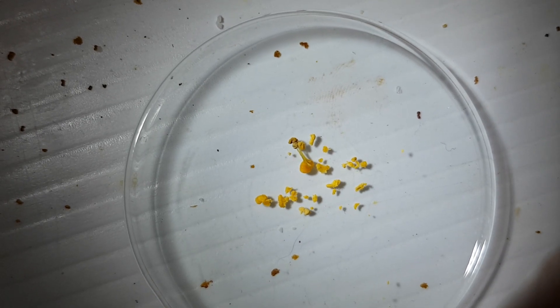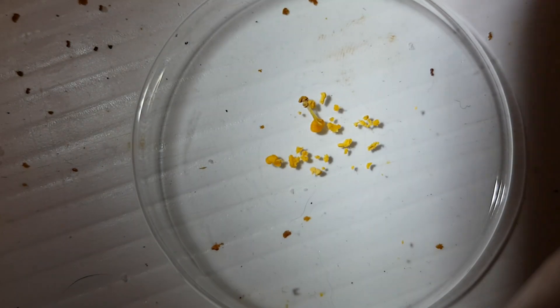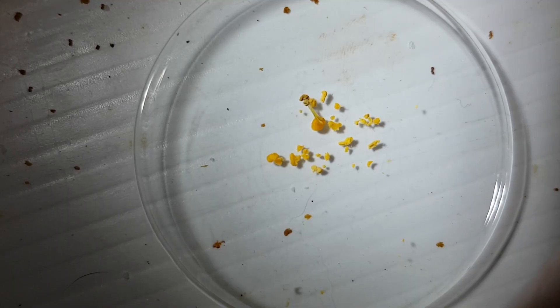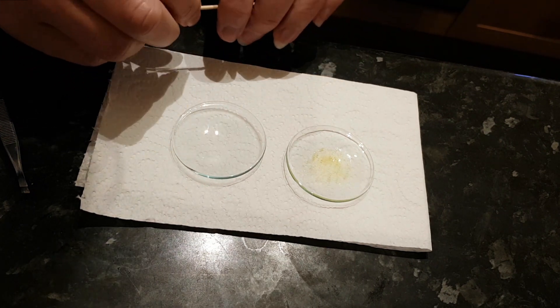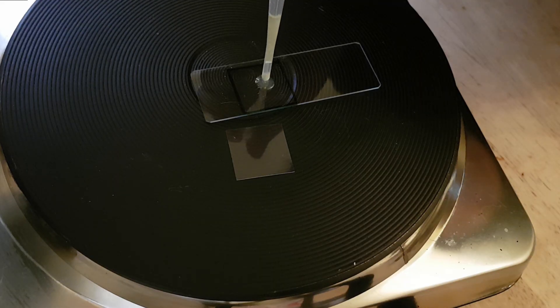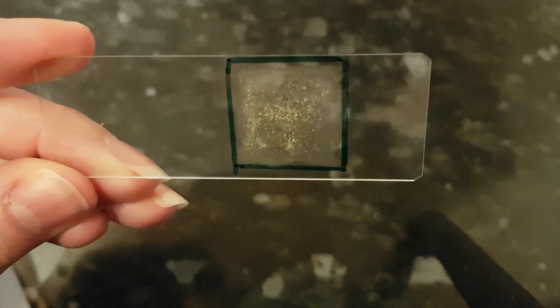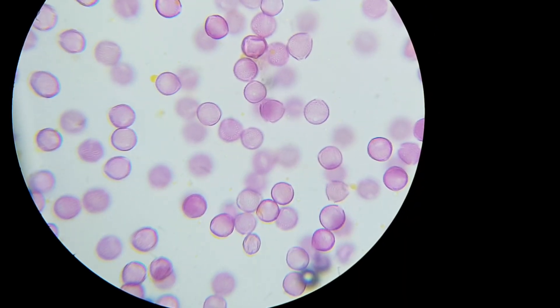There's a bit of a clue attached to one of the pollen loads as to where the bees have been — there's an anther stuck to it. But let's get this small sample onto a slide so we can either confirm or deny our suspicions. Now the slide's dry, let's pop it under the microscope and see what we have. The pollen loads the bees collected was ivy.